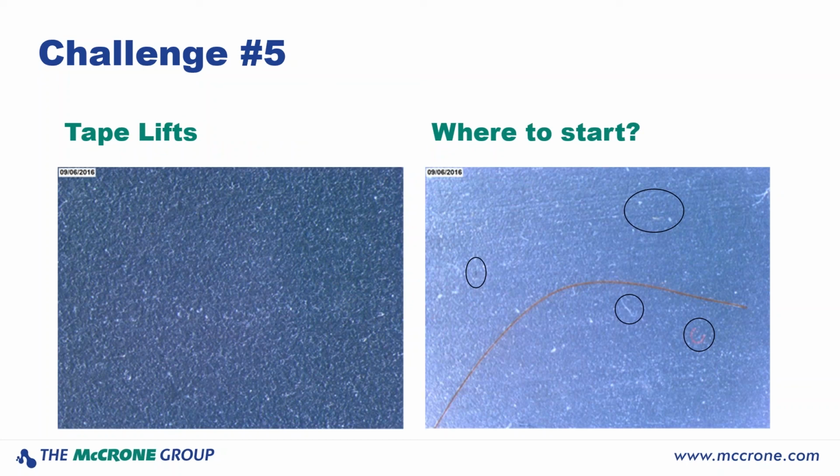Another very popular sampling device is tape. Regular old adhesive tape is a great device for picking up small particles. And when you've got something small on the surface of, say, a plastic tube in a manufacturing facility that you want to sample, grab a piece of tape, stick it on there, and peel it off. That's a pretty quick way to grab it, and you know it's not going to go anyplace.